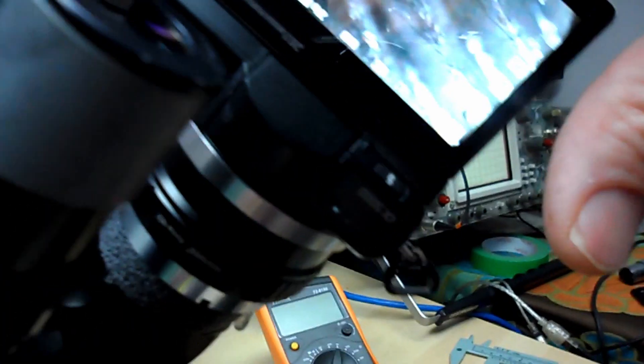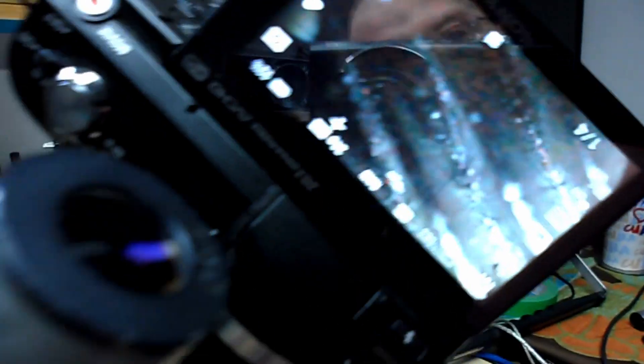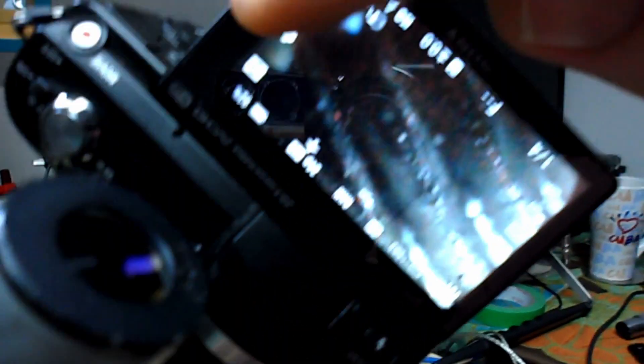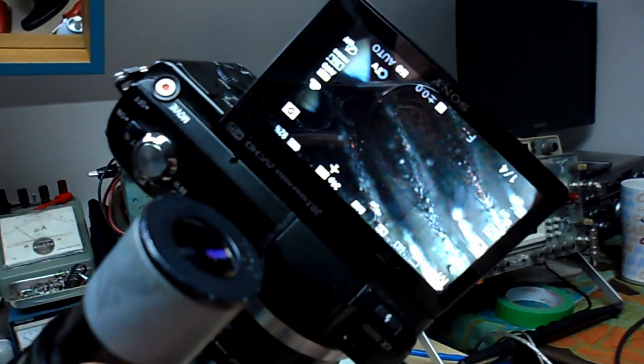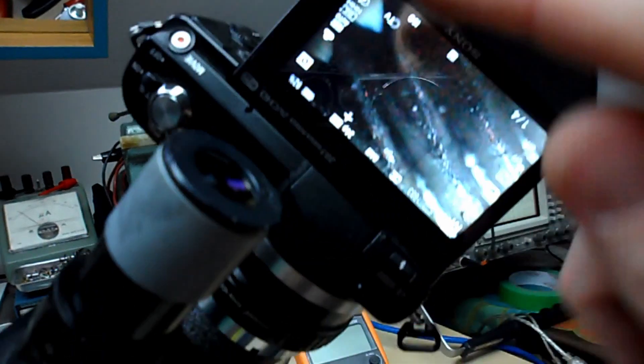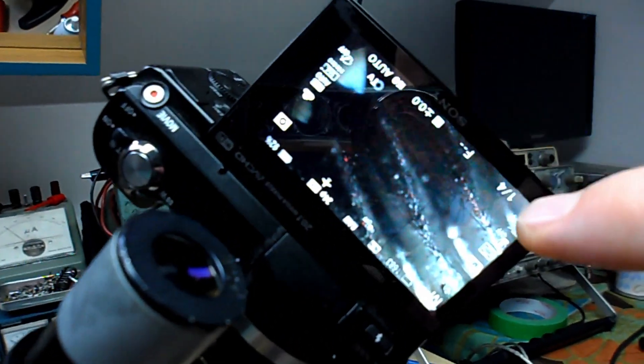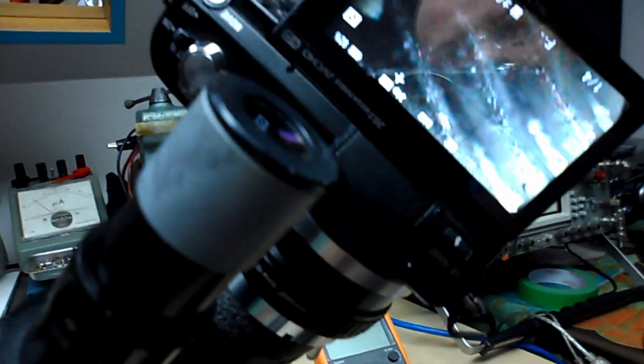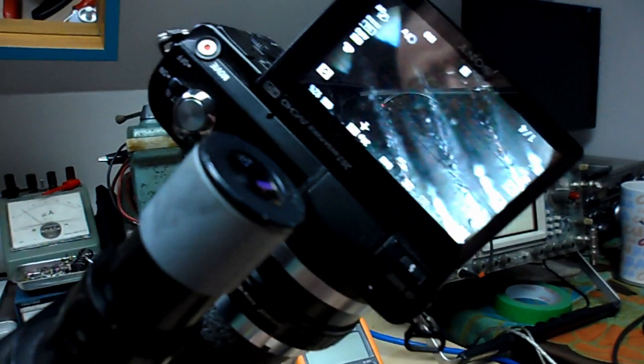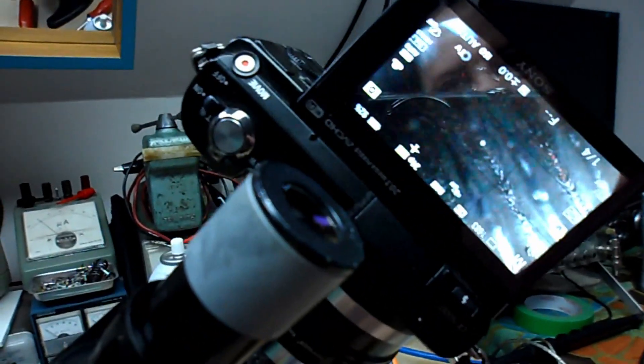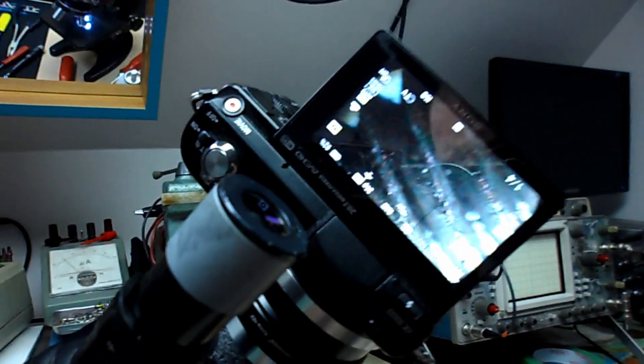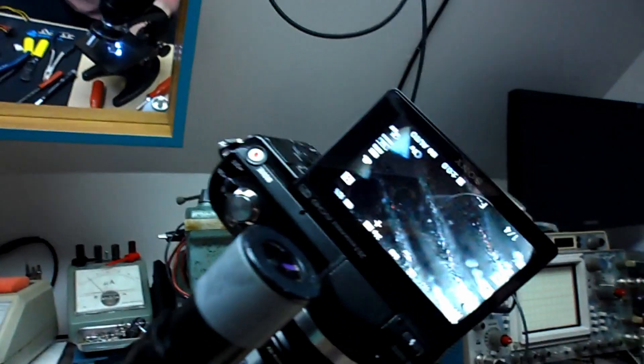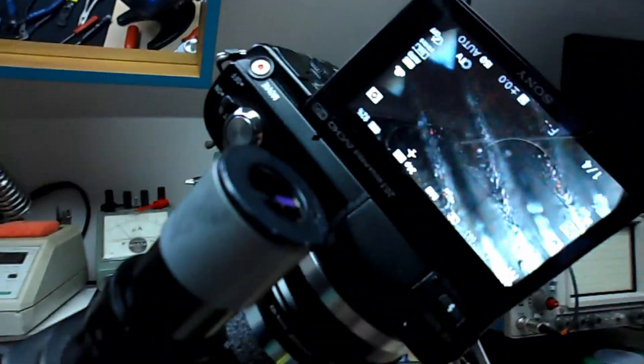It may not be quite as... it's pretty good. Most of the image is, you know, there's a circular profile coming up, that's the image. You can kind of see it's almost like vignetting, there's a bit of a corner thing. But you really have to move the light around to catch that. But it's really not bad and for anything I'm going to do with it, who cares honestly. It's close enough, it gets the point across.